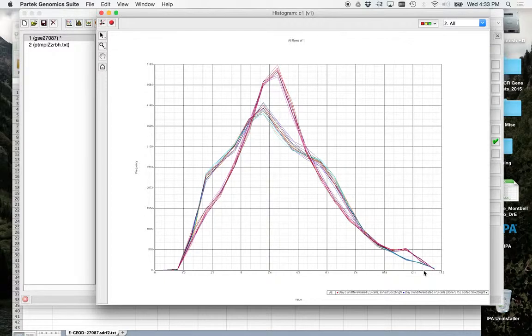If you don't normalize that data, you have a scale that goes anywhere from 0 to 15,000. We don't like those scales in statistics. So if you take a log 2, you're reducing that standard deviation. You're smoothing things out. And you can do that because you apply it to all the data. You don't selectively do it.